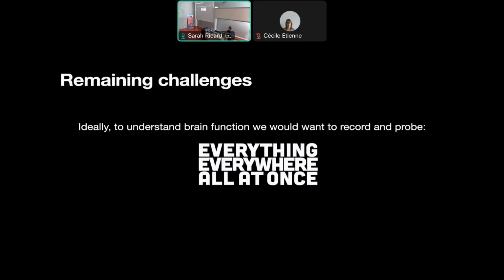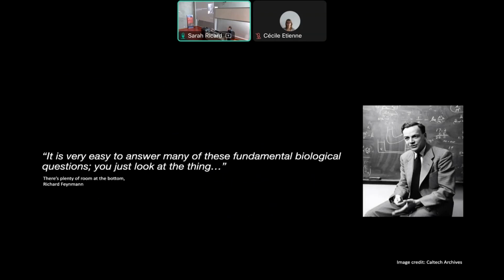And the summary of all of those questions is, okay, Ruth, but really what we want is a microscope that allows us to see everything, everywhere, in the brain, all at once. And lots of physicists think that's kind of easy, right? This is a famous physicist, Richard Feynman, who says, biology is easy, right? You just look at the thing. Okay, but there's a lot of nuance to that question. How do we just look at a thing?